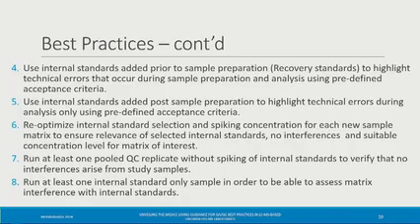We can add a note of clarification. If you spike internal standards first, this is not going to work, but it's also best practice, so it's not mandatory. So if for a particular design you are not using it, that would be okay as well. But excellent point. Okay, we have a hand up here.